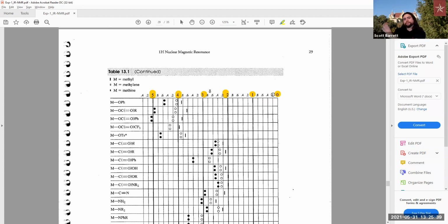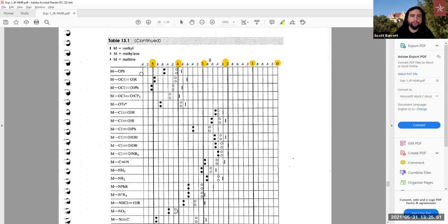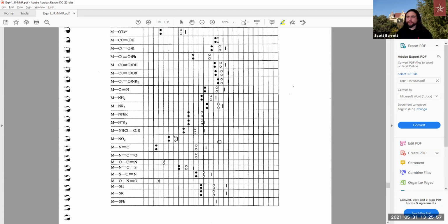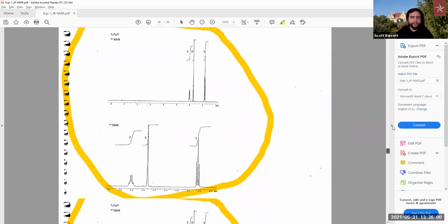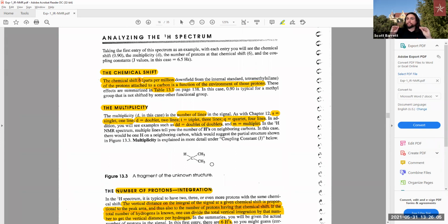And so you can see here from 0 going to 5 parts per million, this is the scale going from right to left. So make sure that you understand whenever you're looking at a spectra where to look at the specific groups for the specific locations of a given compound or a given functional group. So let's go back up here to the top. That's the main part of chemical shift, is the location. Just like in the IR spectra, you had specific wave numbers. The chemical shift, the ppm, that location is going to be where a specific proton is attached to a given functional group or compound.